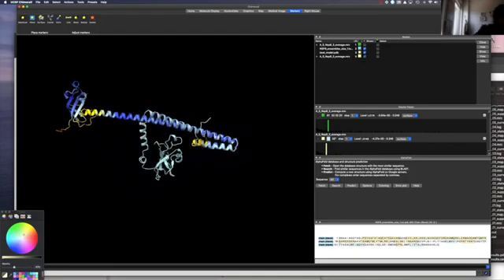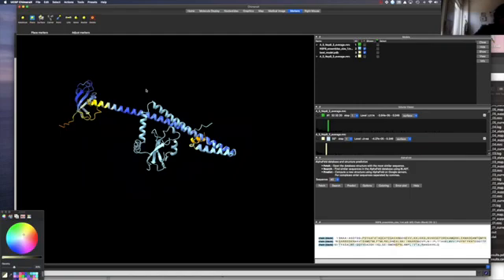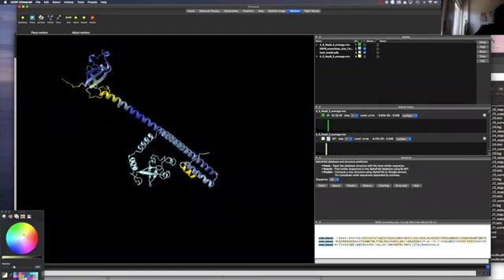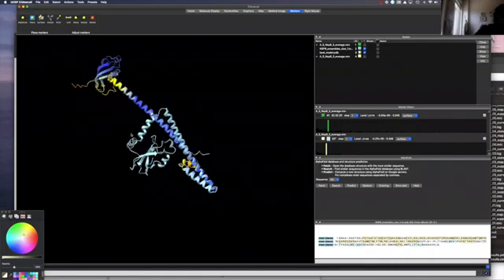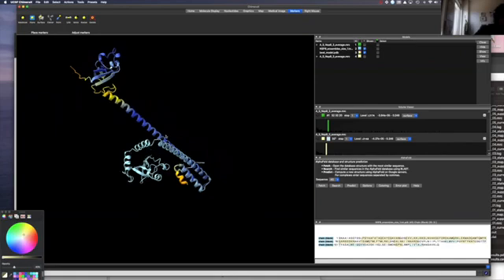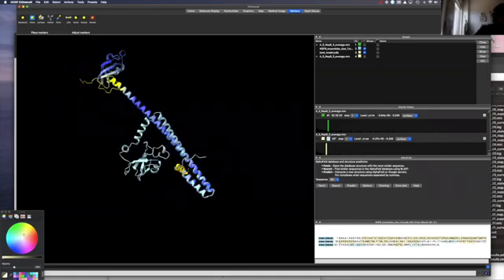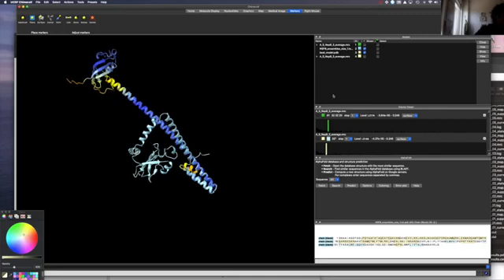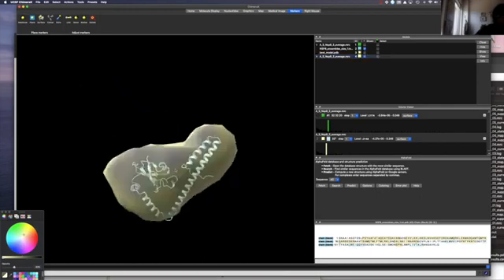I'm going to disable the shape, and you will see that what's really happening here is basically the local flexibility. The flexible region allowed the folded back structure, and actually this model fits the SAXS data pretty nicely. And not only the SAXS data, but I know you are keen to see something in 3D.